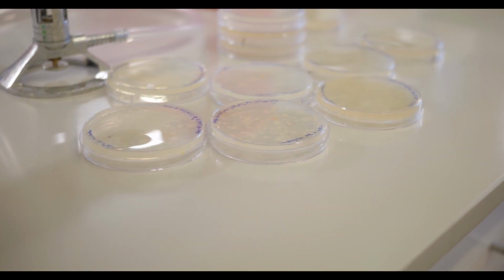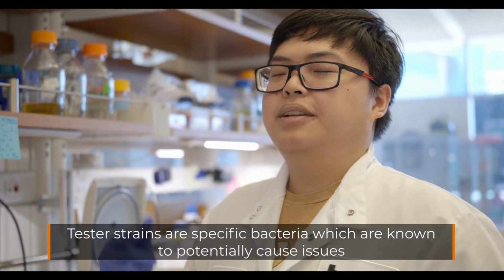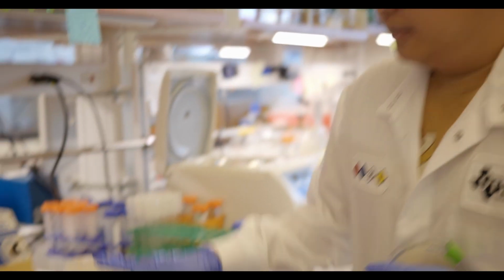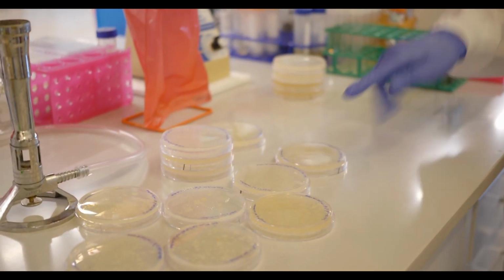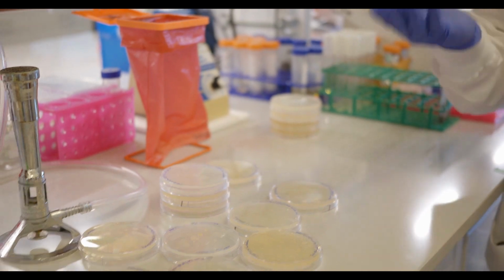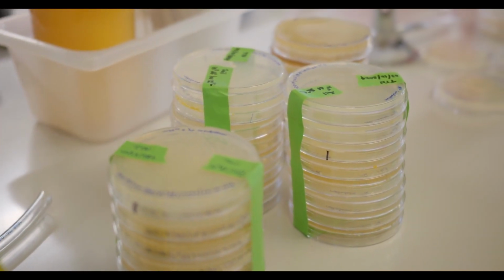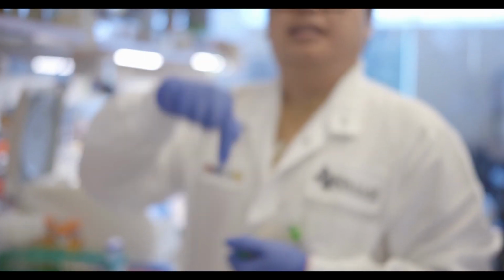One of the tests that I'll do after is I'm going to grab what are called tester strains, which are specific bacteria that we know can potentially cause issues, and I'm going to spread it onto a plate. I'm going to take one of my soil isolates, streak it inside and see if it can produce antibiotics against it, and that should be seen as a clear zone around the bacteria.